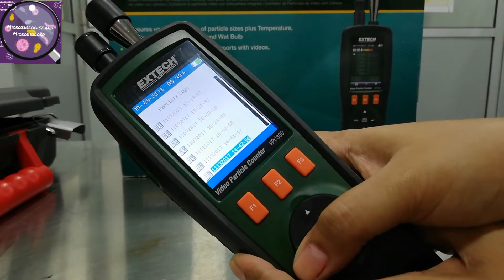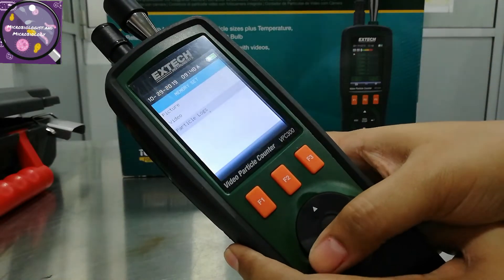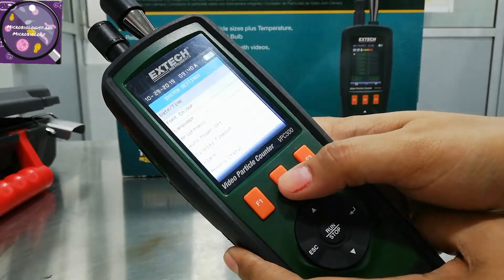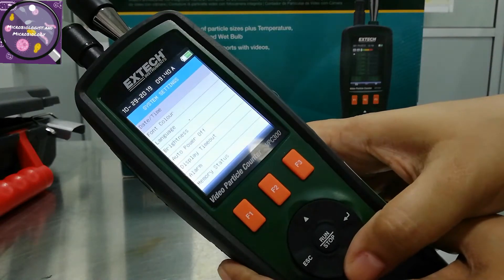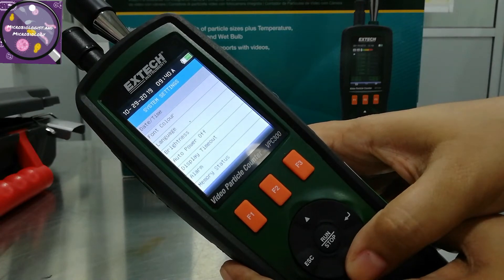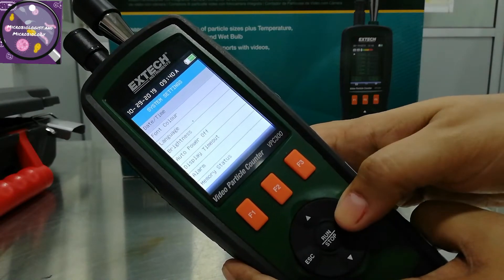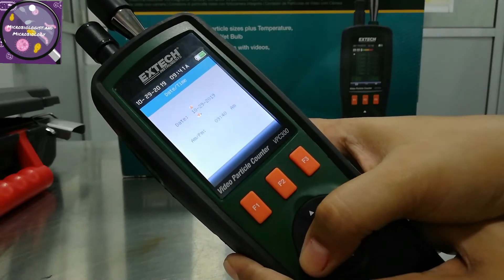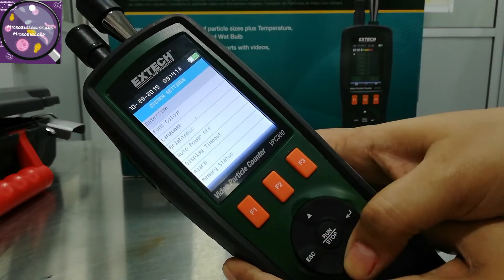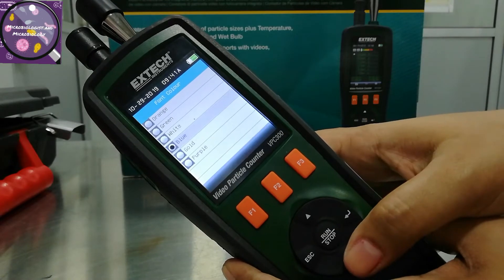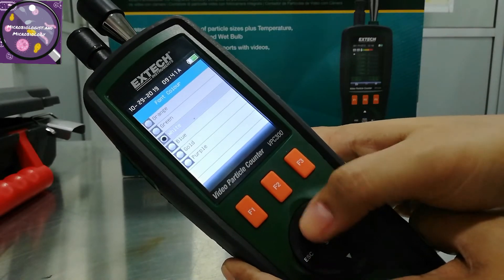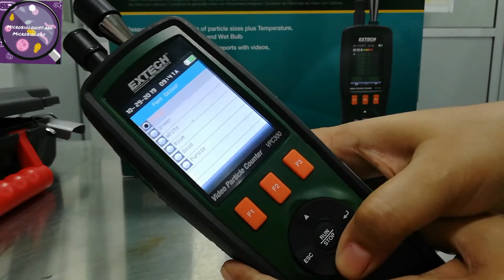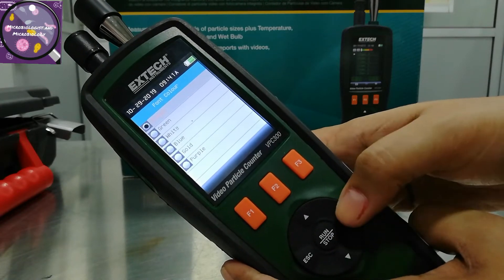In the PC it shows results as per time and date. I have exited from F1. Now F2 is for the system settings, in which you can select the date, time, font color, language, etc. Here you can also select the font color — blue, white, green, gold, whatever you like.